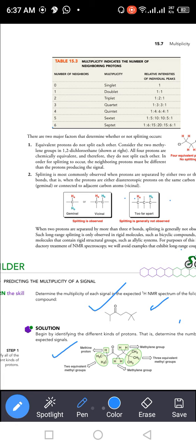and these protons are encircled. So with the encircled protons, we are in a position to discuss the total number of signals. So the total number of signals: one signal for this single proton, second signal for these 2 methyl groups, third signal for 2 hydrogens, and fourth signal, in total 5 signals.